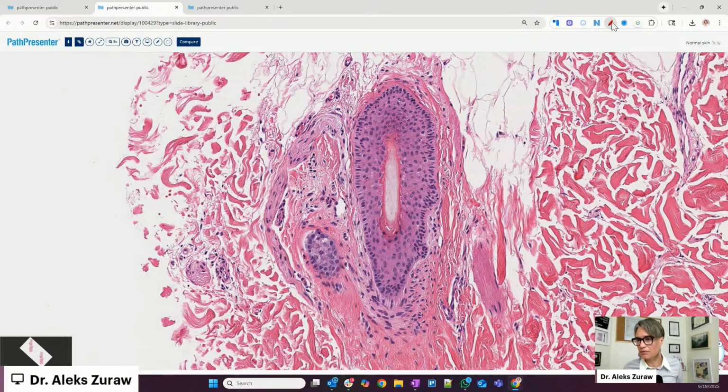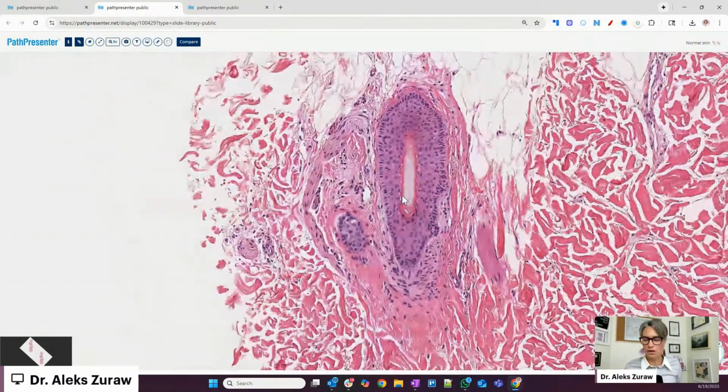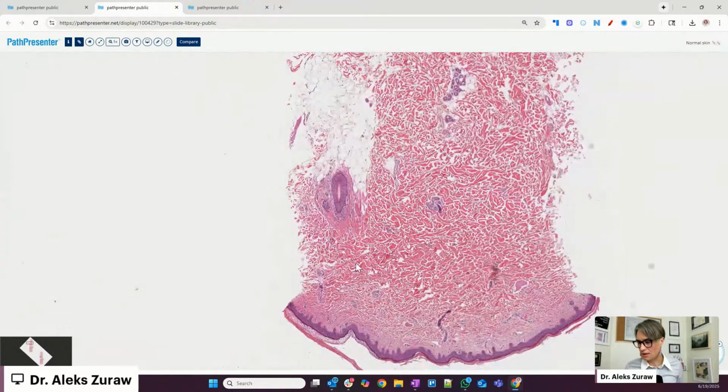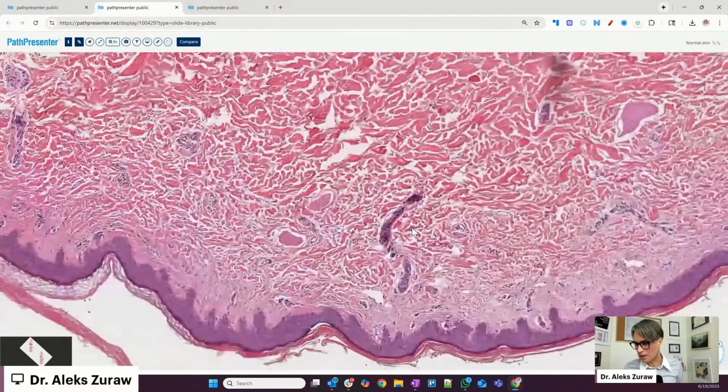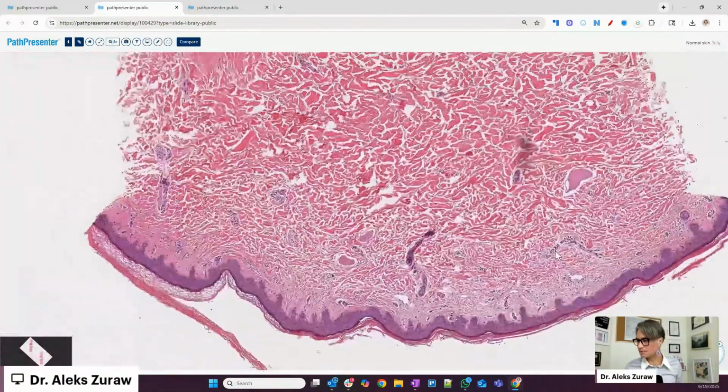And when I find a bare hair for you, I'm gonna make a histology video just on a hair follicle. For this one, I'm just gonna leave you with that this is a hair follicle. Anything else interesting? No, we're good.